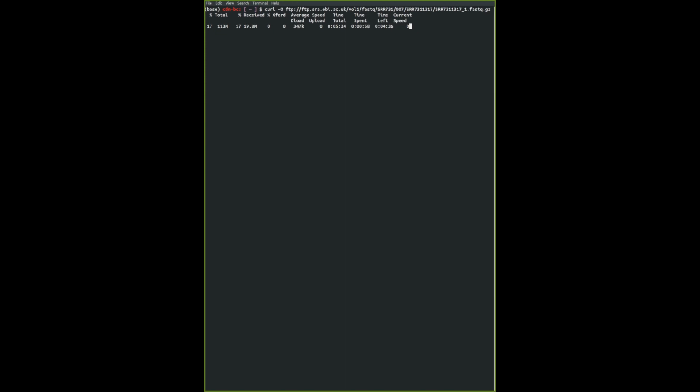It is taking a bit slow today. Hopefully you're done, or hopefully you're not having too much of a problem. Mine says it's going to take 20 minutes. No, okay, that's not good. I have some major errors in my terminal. What does it say? My terminal is beeping at me, and it has become a huge array of question marks and random letters.